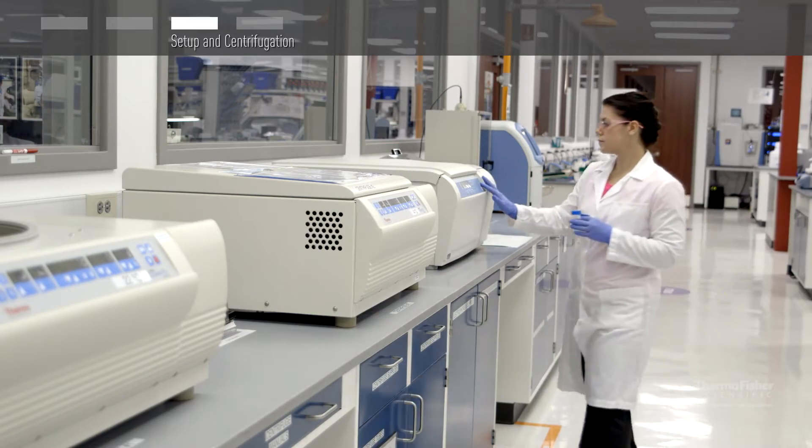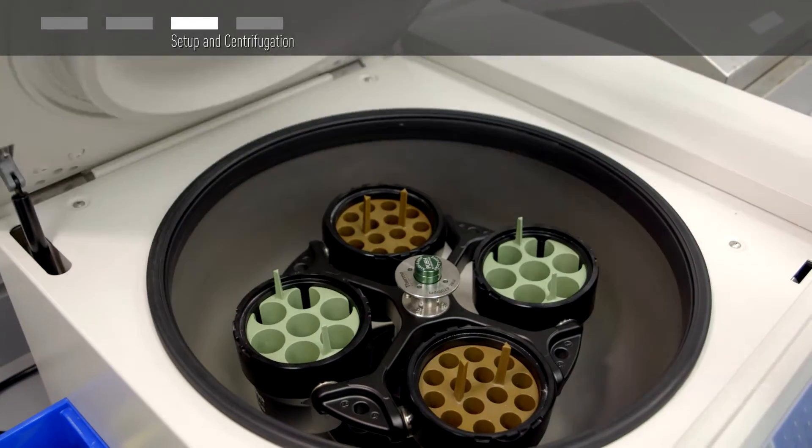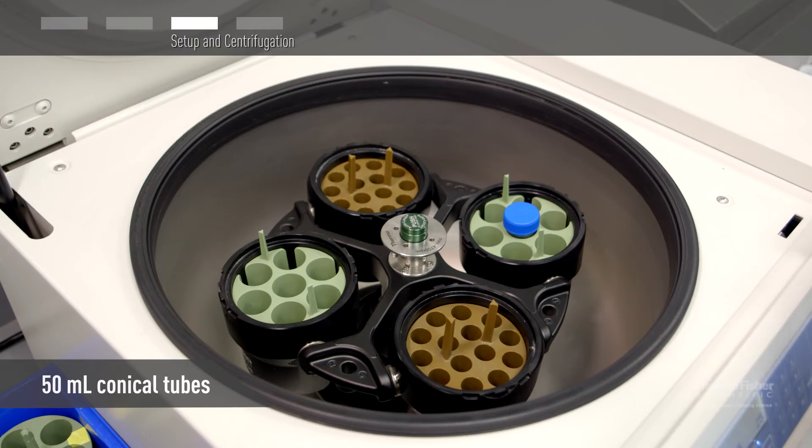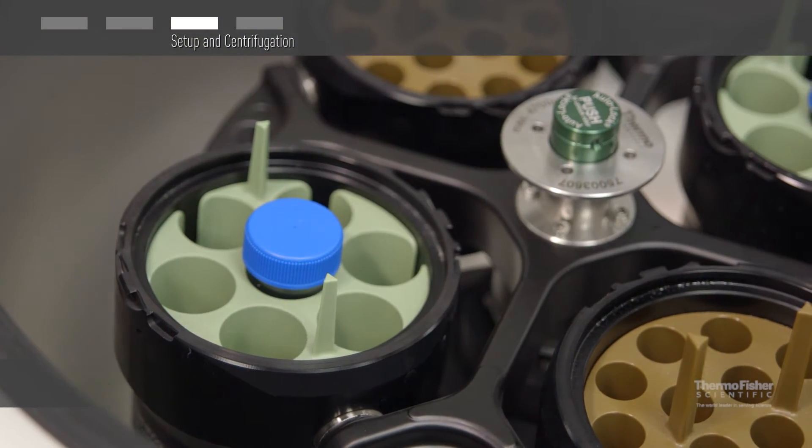Place the concentrator into a swinging bucket rotor as shown here or a fixed angle rotor that accommodates 50 mL conical tubes. Make sure that the concentrator has a proper counterbalance.